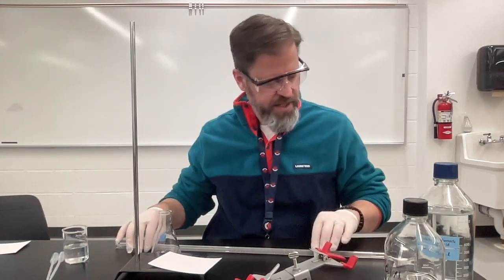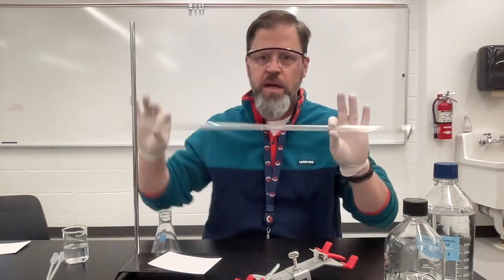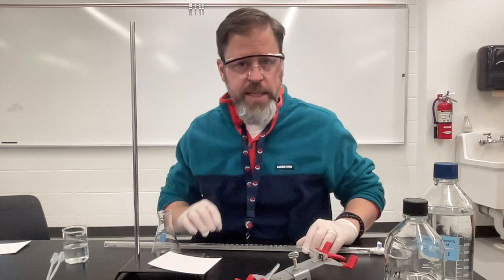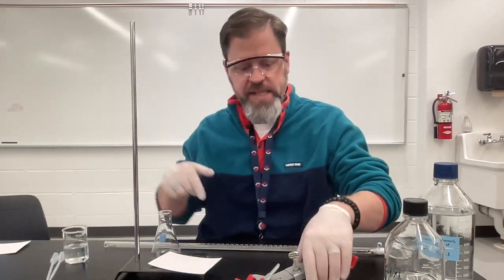I have all of the equipment here. A major component of a titration is this long piece of glassware that we call a burette. The burette is going to allow us to very accurately deliver a certain volume of a solution into our sample here.